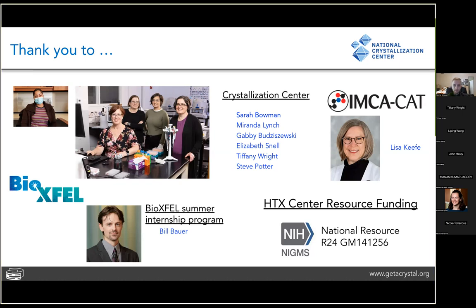Right. And I think that's important for people to realize that the Marco algorithm that you've implemented in Polo really was only trained on bright field imagery. Yeah, exactly. So Polo allows viewers to look at the other image modalities, but they are not part of the actual scoring algorithm. So yeah, exactly. That's correct.